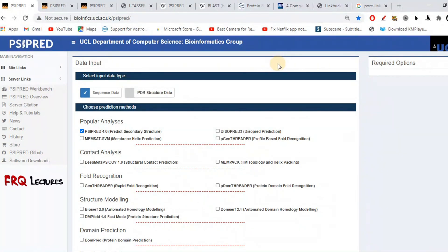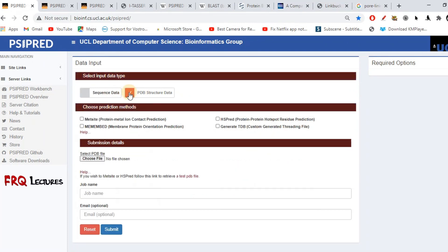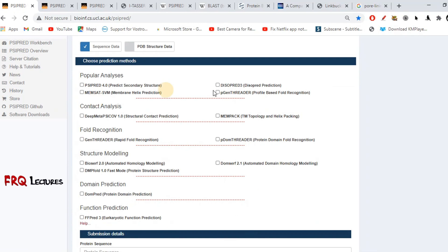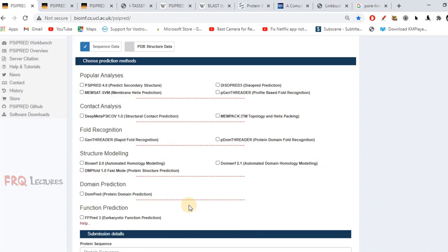If we look at the home page, it is quite simple and we have two options. Either we can feed it the amino acid sequence or we can give it the PDB structure data. If you look at this particular portion, we have multiple options. We can check different things according to our requirement — fold recognition, domain prediction, or the function of our query protein.